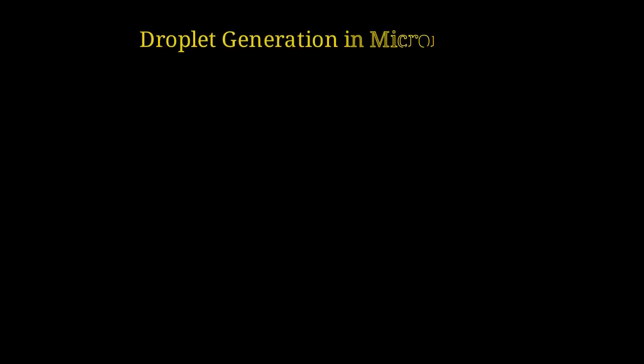Welcome to this lesson on droplet generation in microfluidics. Today we're going to explore how tiny droplets are created at T-junctions and flow-focusing nozzles, and what physics controls their size and frequency. But first, why do we care about generating droplets?